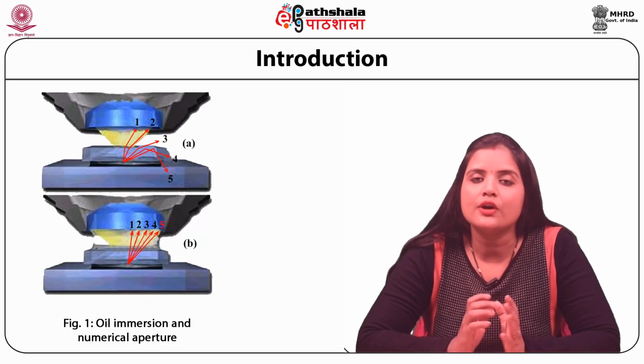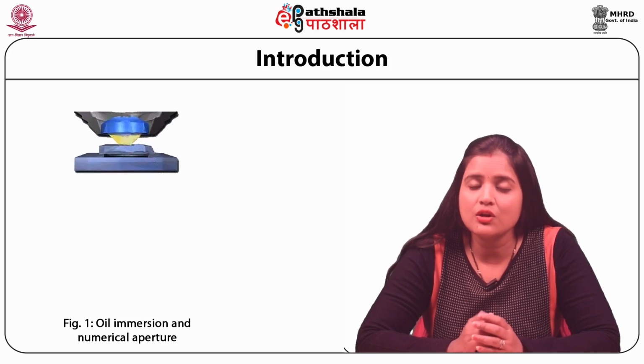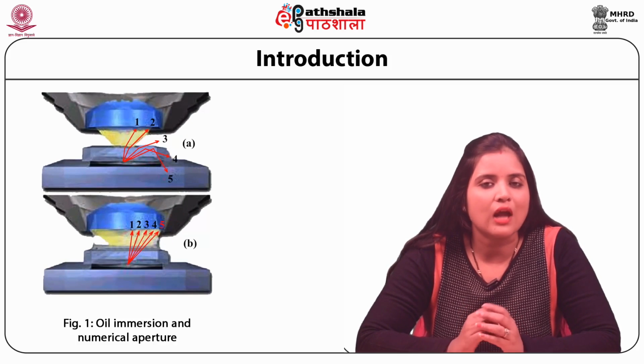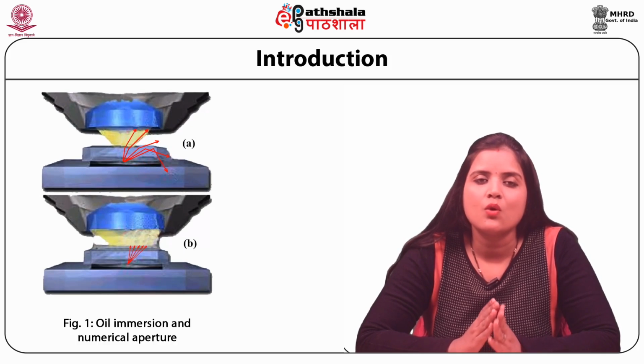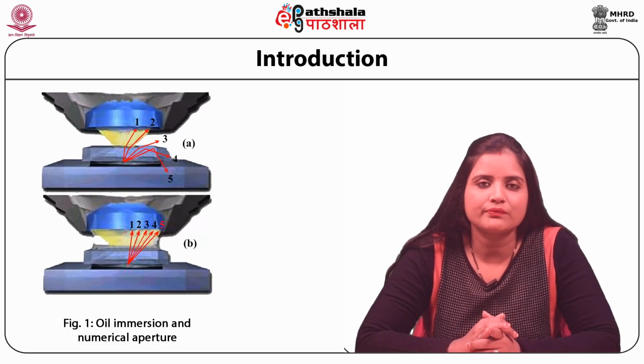Immersion oils are used in microscopy owing to their transparent nature, viscosity, and specific optical characteristics. Typically, oils having refractive index around 1.515 are preferred.